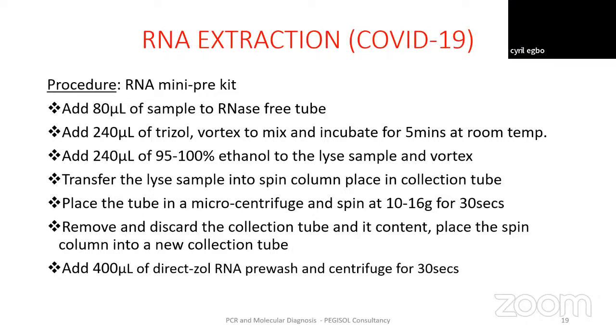For COVID-19, you swab the nasopharyngeal and the oropharyngeal, then you put it in VTM. In the case of paternity tests, they may not put it in VTM or PBS. They may just bring a swab stick that contains a swab of the cheek.